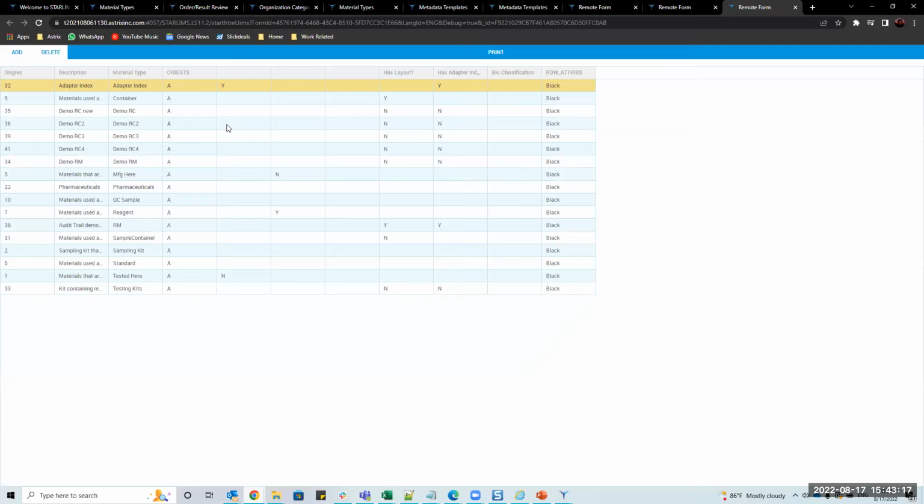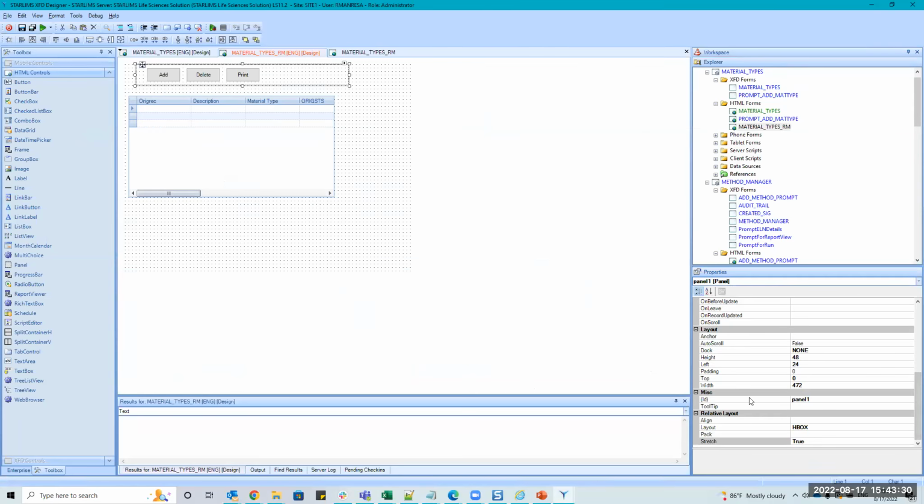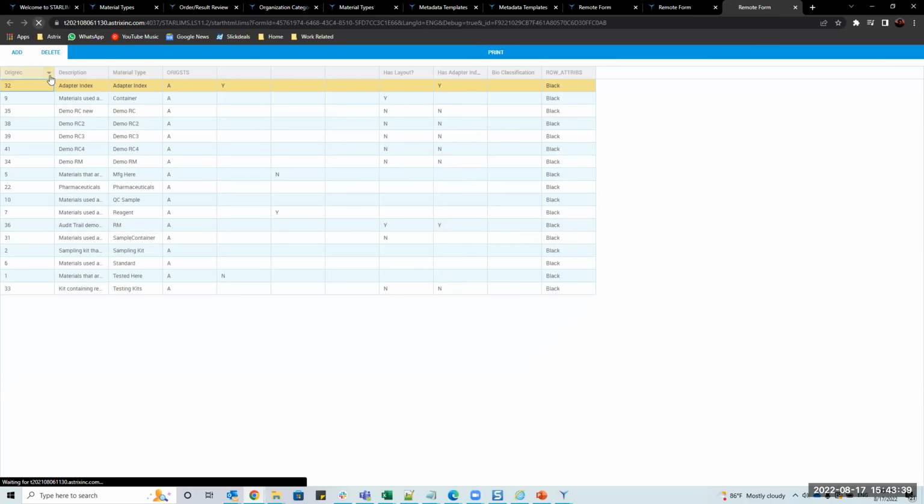So yeah, the best thing on this is to just play around with them. Look there, you can clearly see the whole button is stretched out. And there's no space really between them. So that's another little property that you can play with. You can give it some padding. Refresh here.